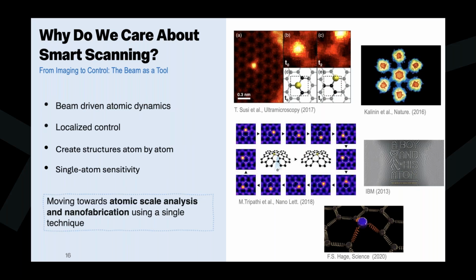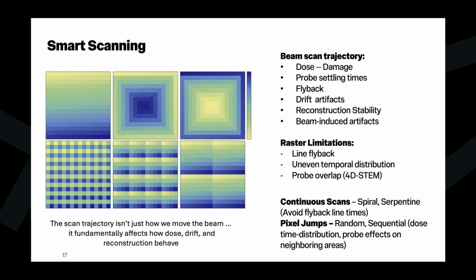So let me show you on the next slide specifically the different scanning protocols we use in this study that we're going to be telling you about today. In the upper left, you have this conventional raster scan where, as I mentioned before, you go across the line and you have this flyback. There's spiral scanning, which is a nice way to avoid these flybacks, as well as these interleaving scans where you're doing multipass and going to different positions.